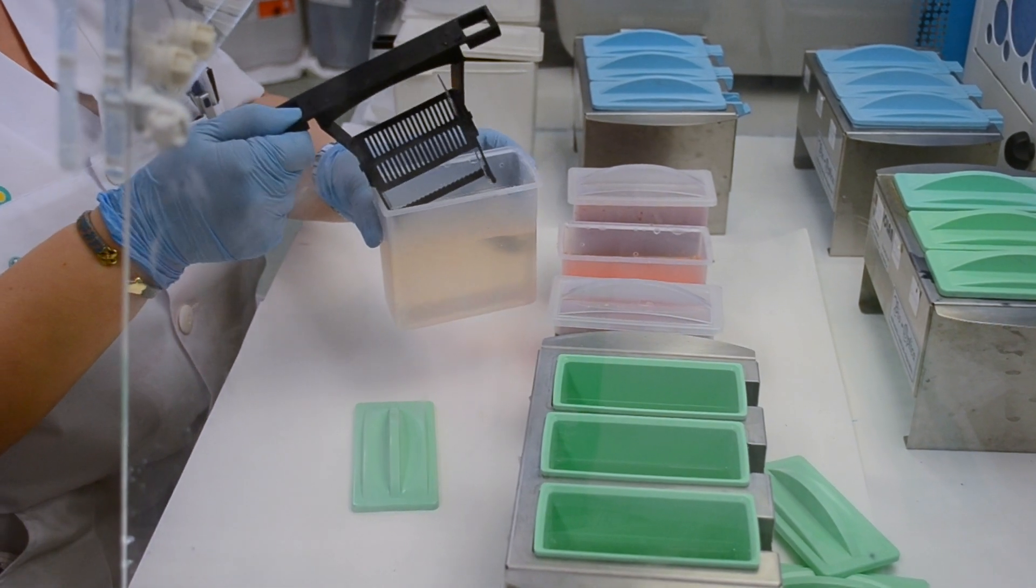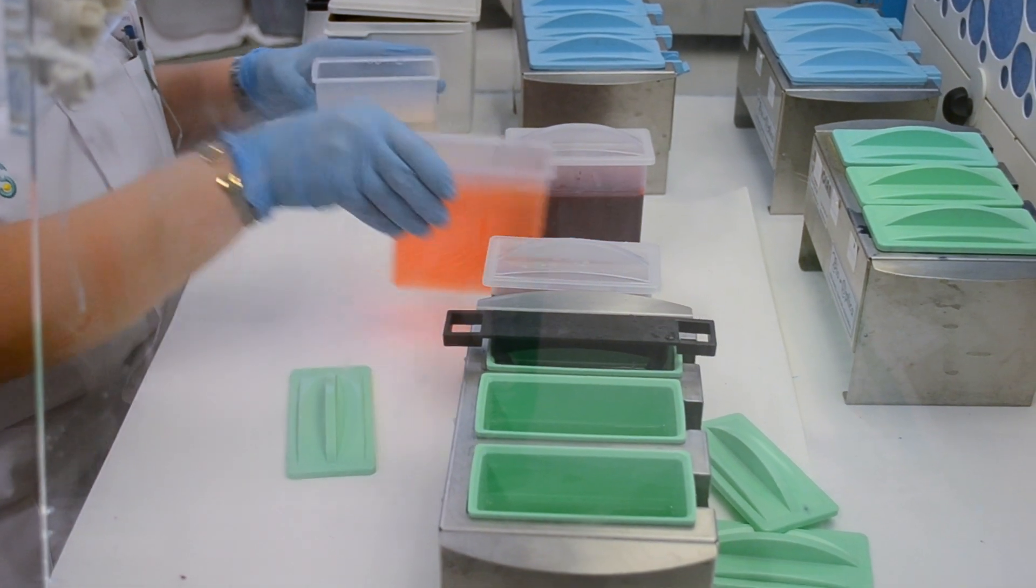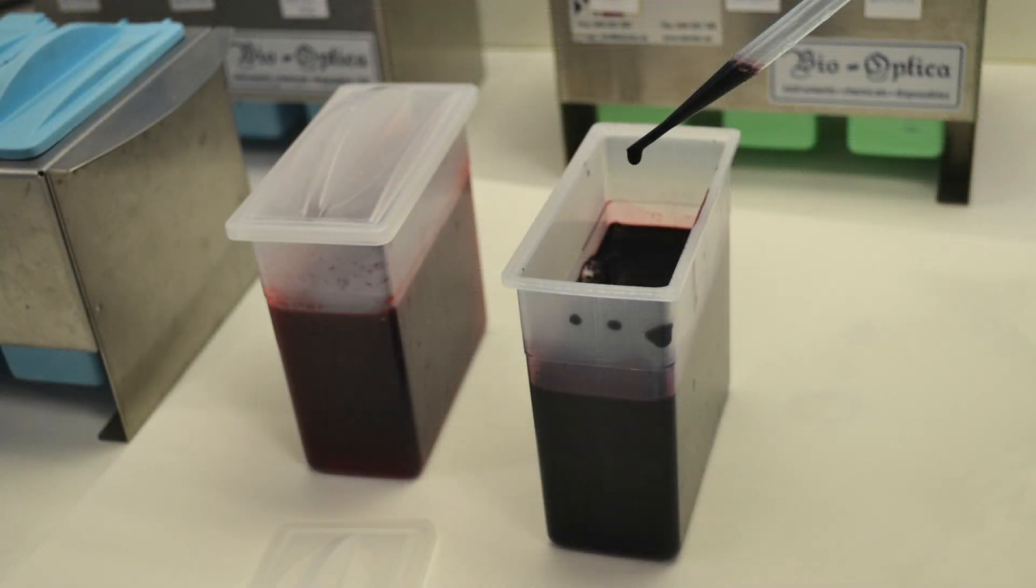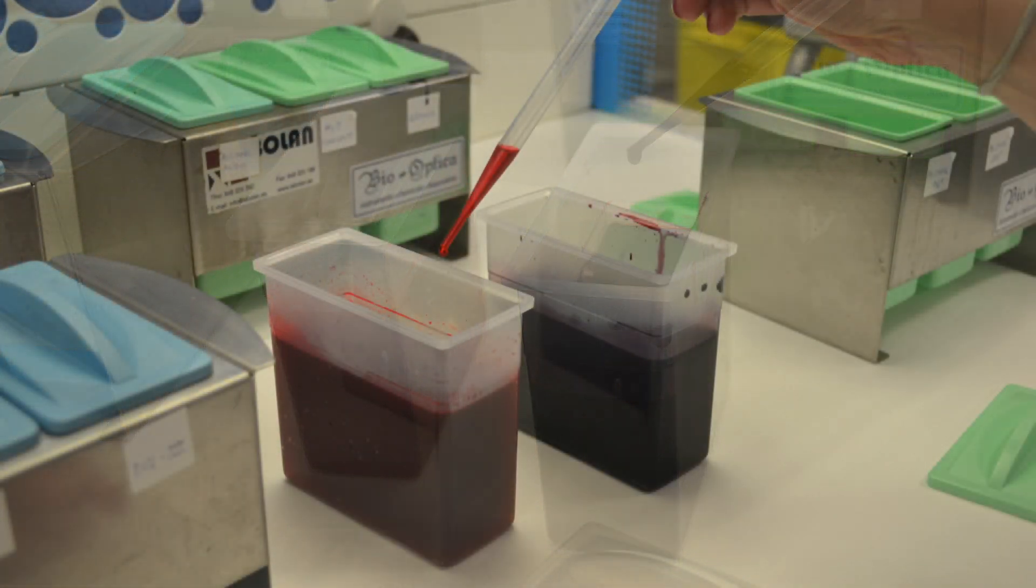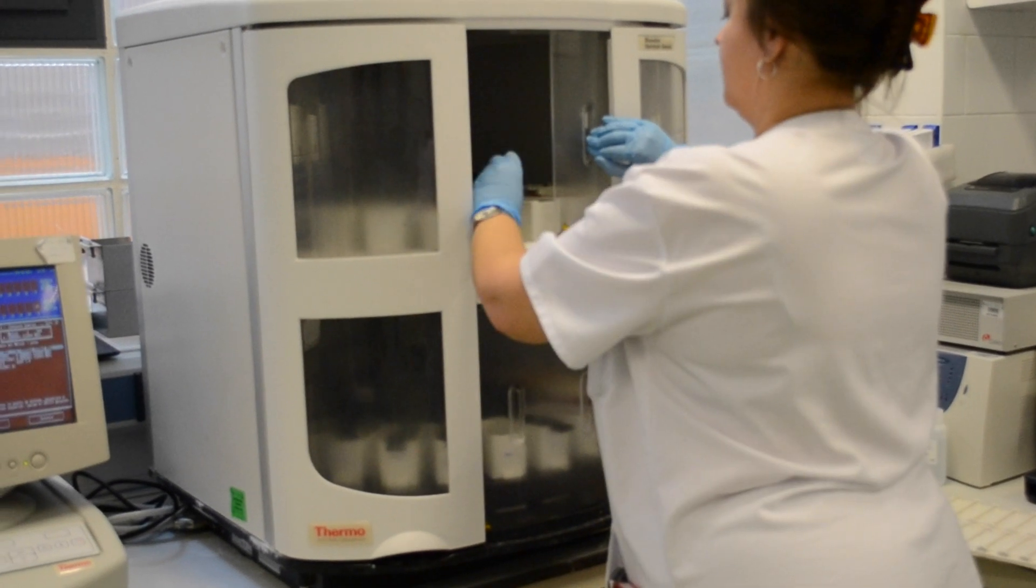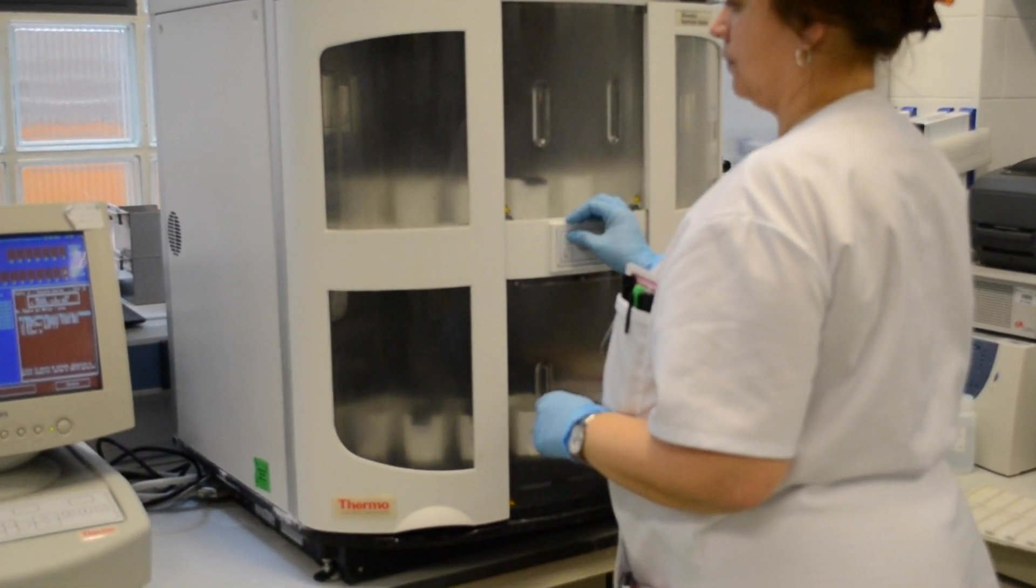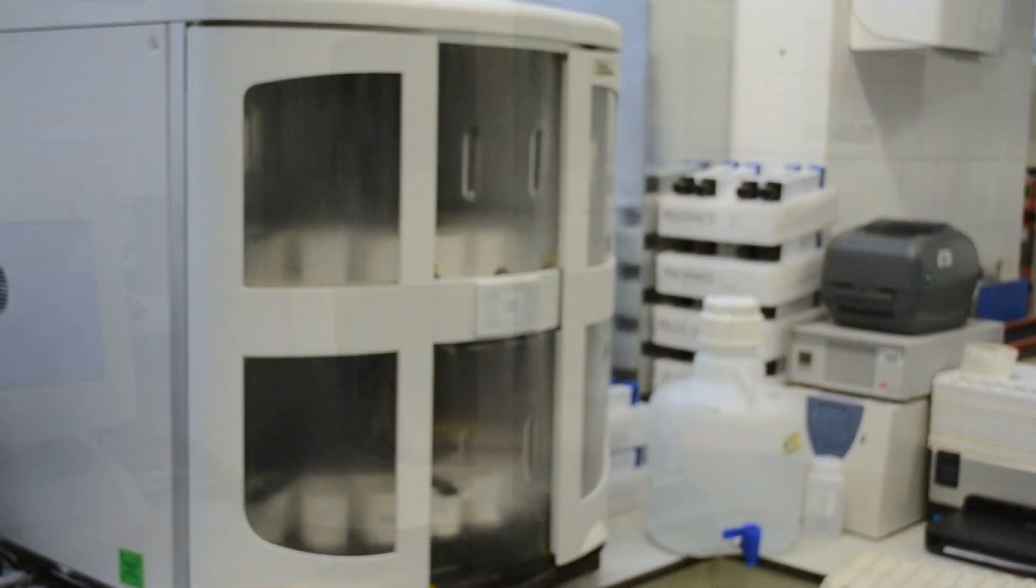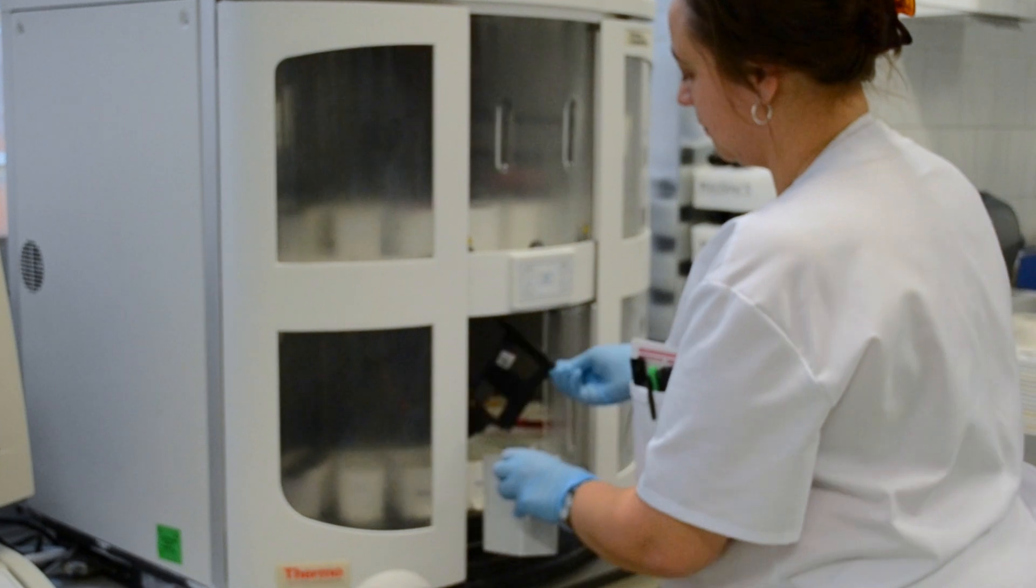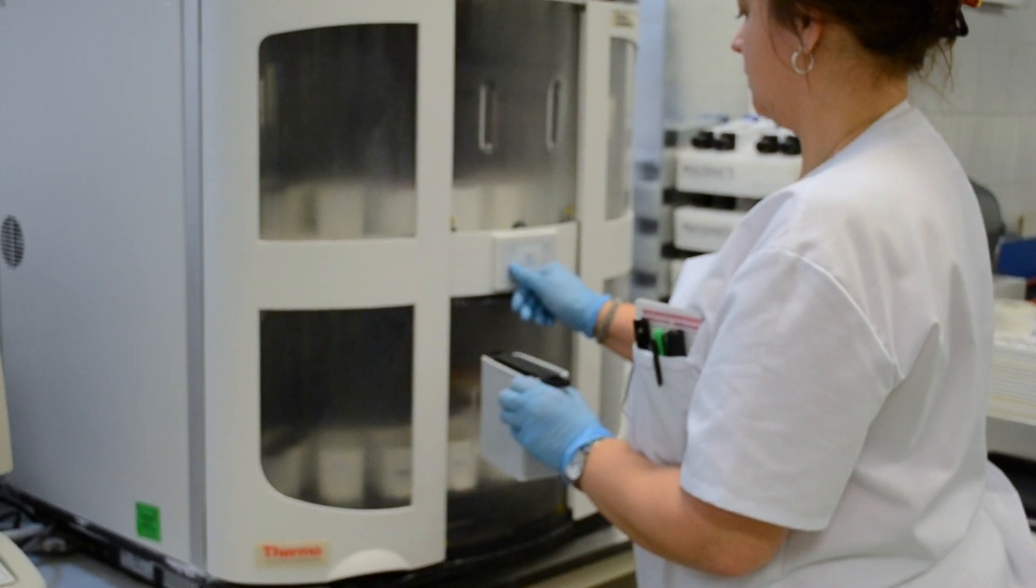The most common stain performed is hematoxylin and eosin, or H&E. Hematoxylin stains the nuclei of cells blue, and eosin stains the cytoplasm pink, revealing cellular morphology of tissues. Because it is so common, there are automated machines like this to reproducibly stain numerous sections with H&E, as well as the previous steps of de-waxing paraffin sections and tissue hydration. The whole process takes about one and a half hours.